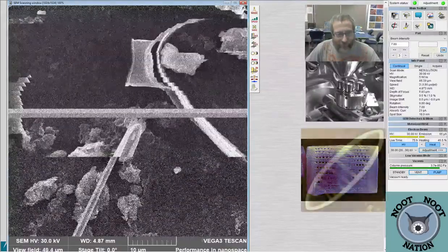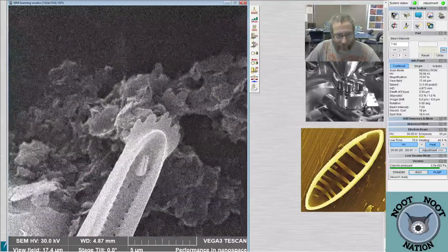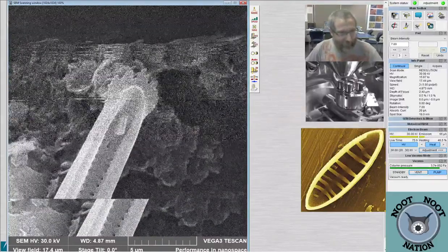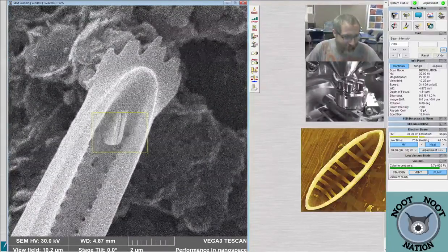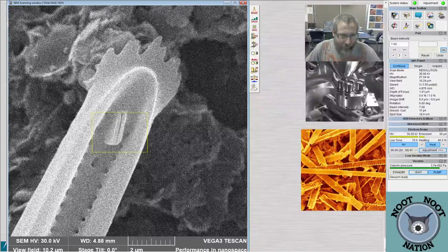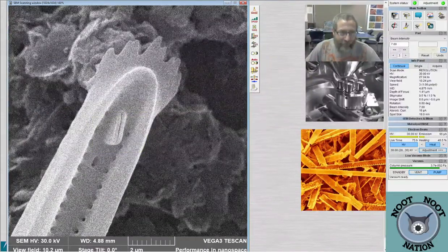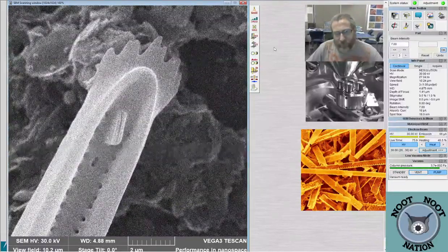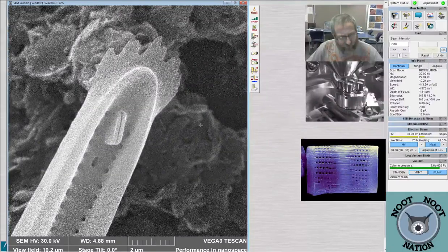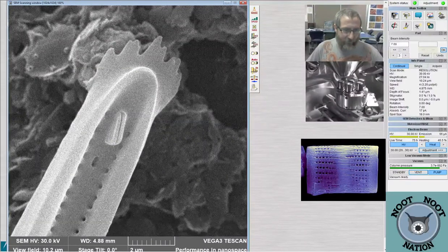See what the other end looks like. Oh, it has the same on the other end. It has a labiate process on both ends. And also a crazy little funny crown-shaped doodad. Yeah, the crown-shaped doodad, it does look like longissima. Oh, so cool.